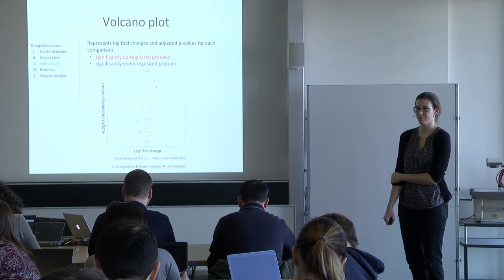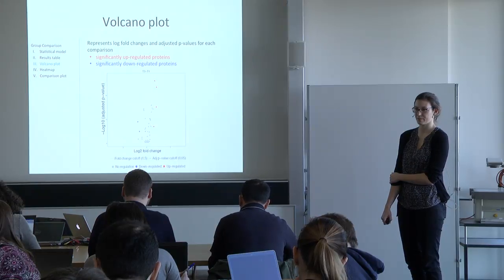Well, as I say, anything you do to your data, if you don't have the actual measurement, is an assumption, right? So there are ways to do it. You can try to fit the curve to your peak and estimate the full area under the peak. You can leave it missing, and if you have more replicates, it will just use the other replicates for that. You can do all kinds of things.